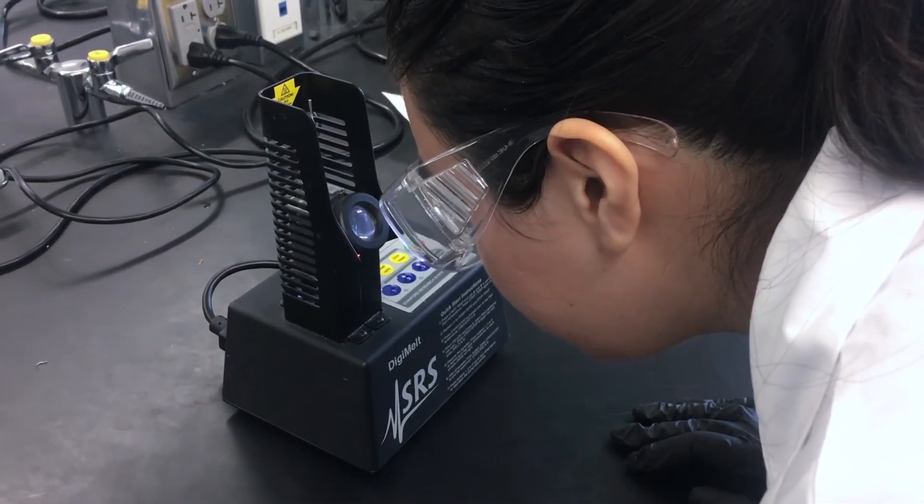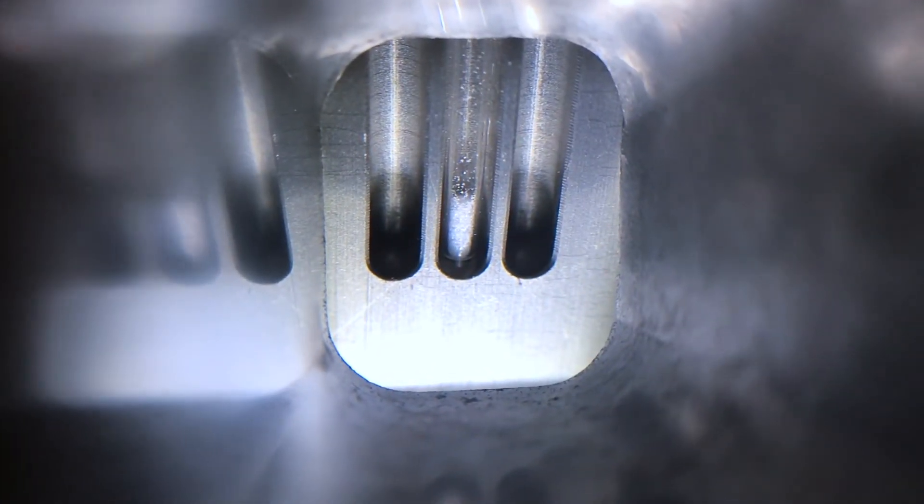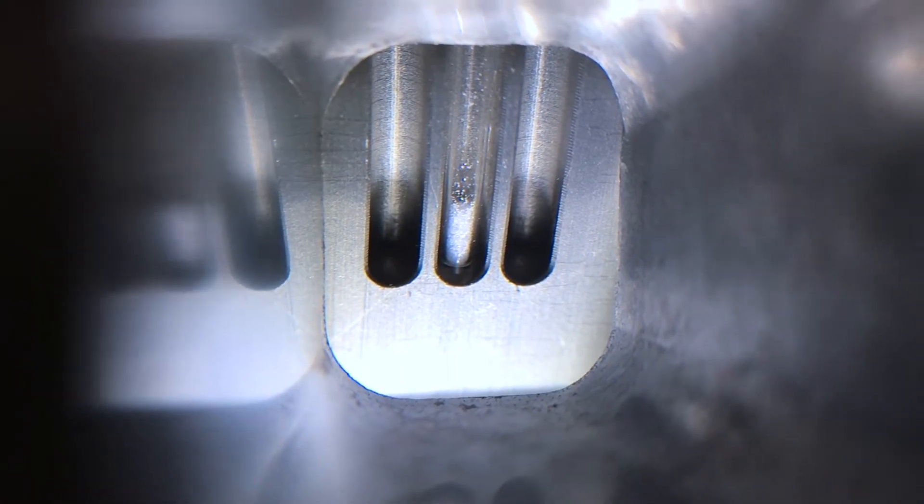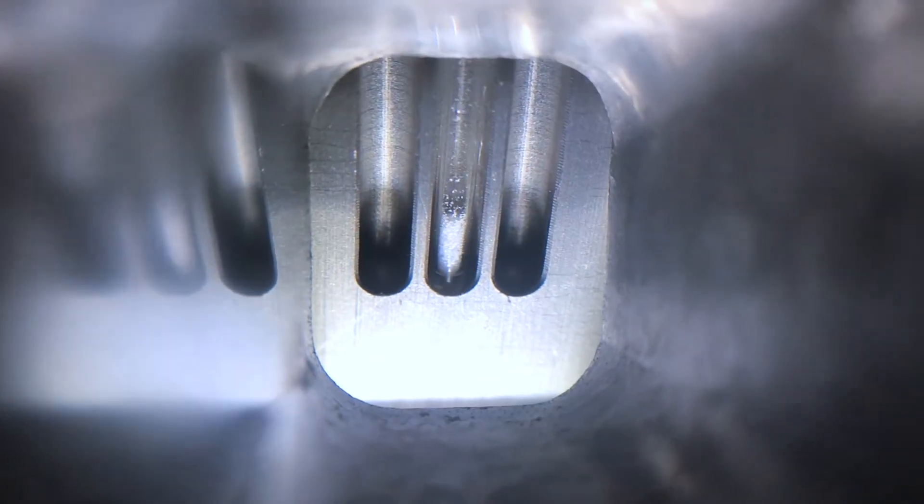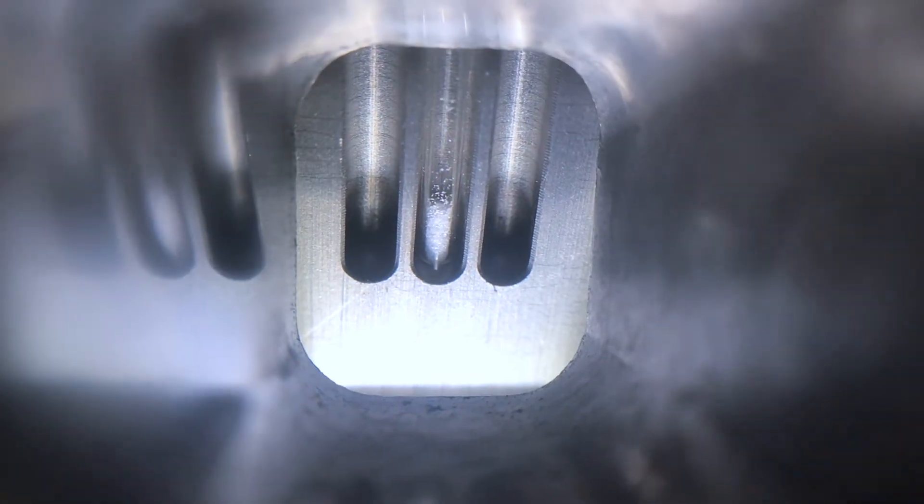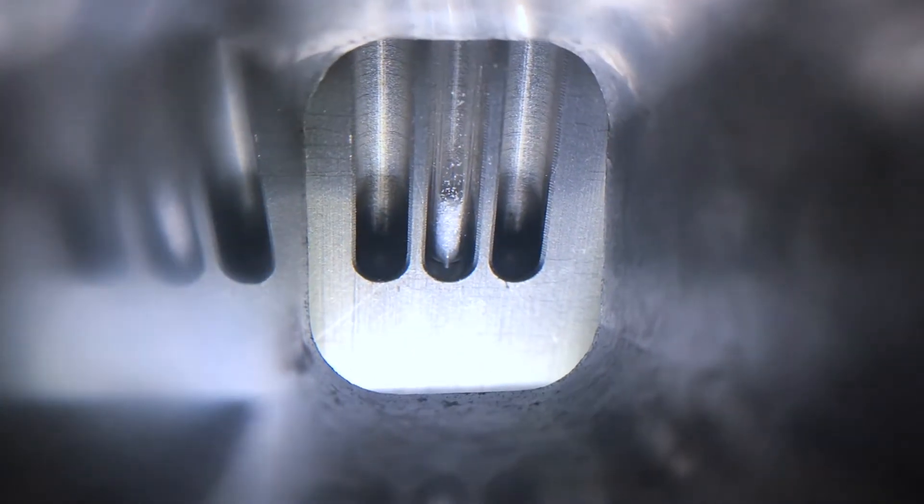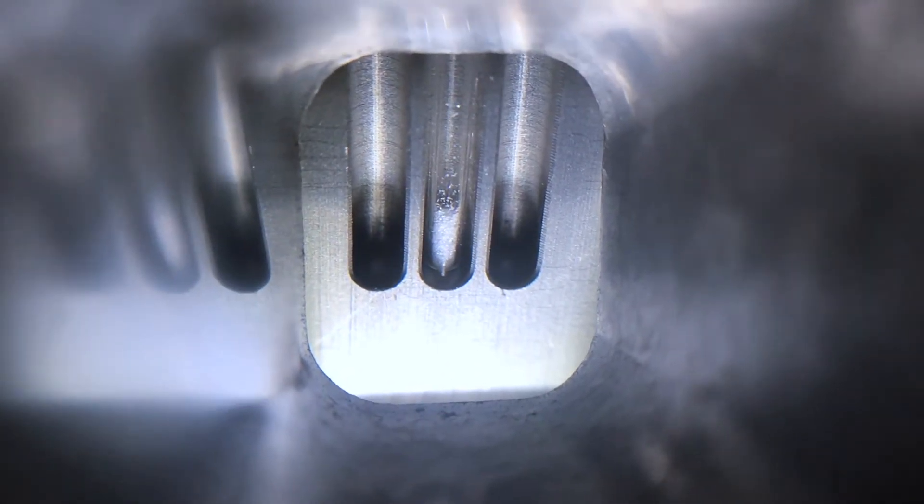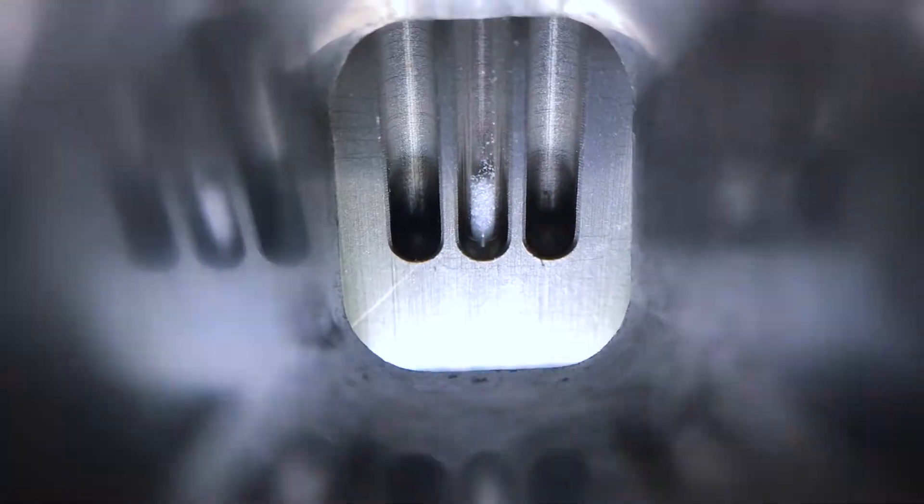Observe the melting process. You should report the experimental melting point as a range. The lowest number in the range is the temperature when the compound just starts to liquefy. The highest number is the temperature when the compound is completely melted.